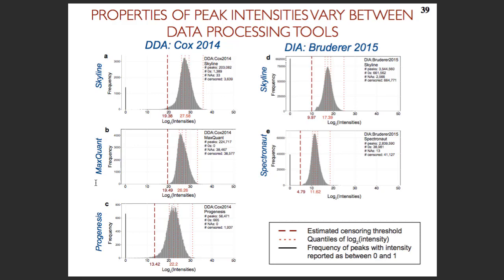So the point where we finished just before the break was that we take as input data in tabular format, which will be the output of different tools, and different tools make decisions, for good reasons, they have their own reasons for that, but they're not the same decisions for everybody. And so we try to understand the intention behind the values as opposed to take them literally.